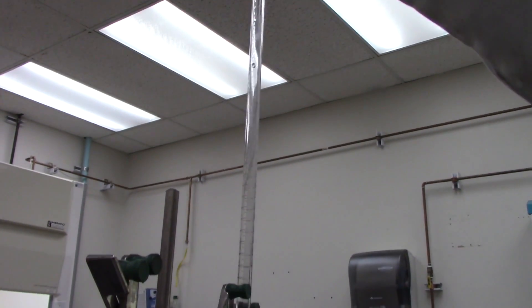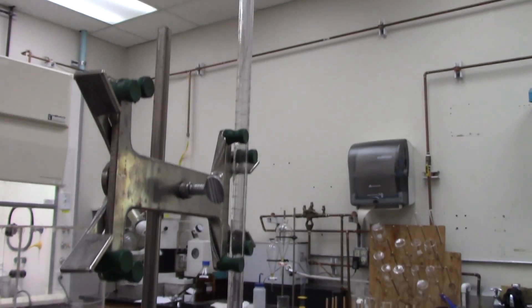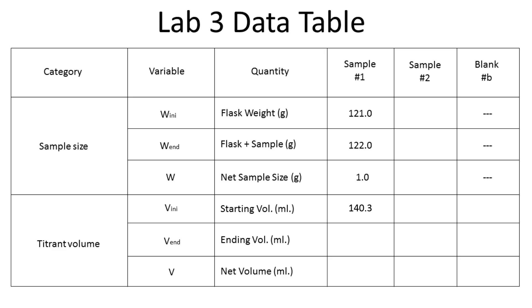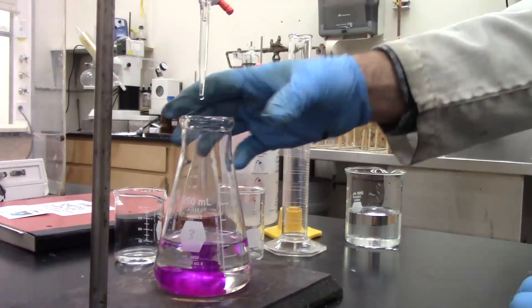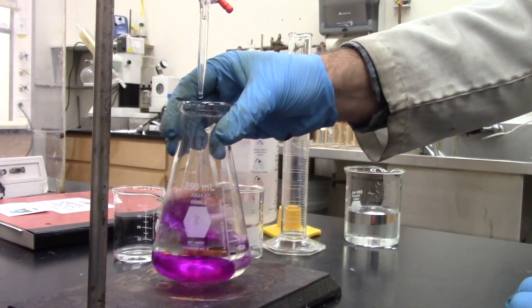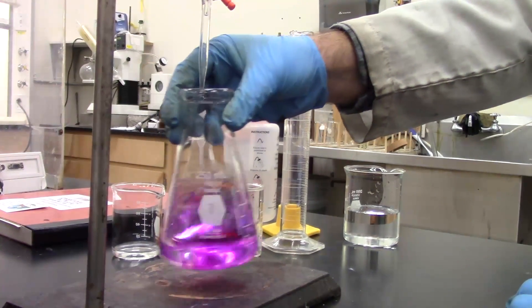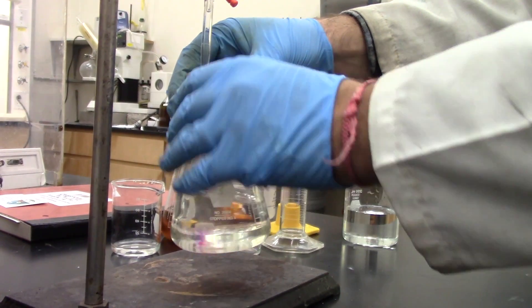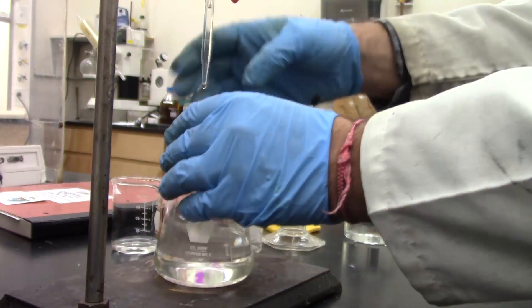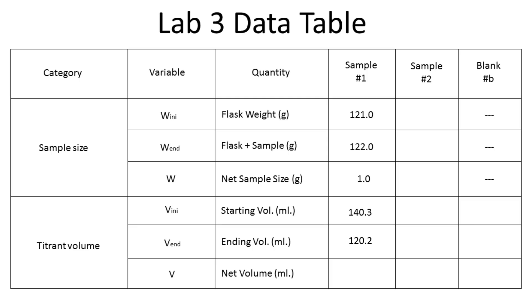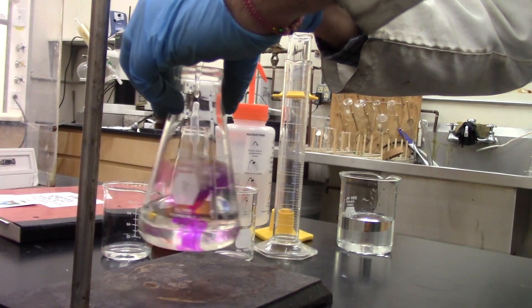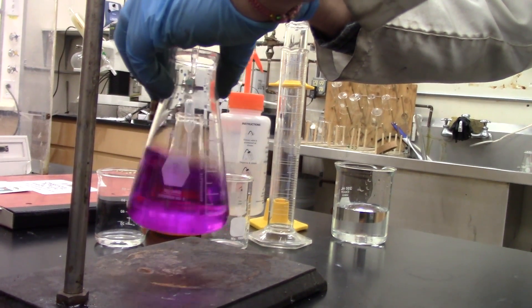Fill the burette with titration solution and record the starting volume of titrant on the data table. Carefully introduce the titrant from the burette into the flask while swirling the solution vigorously but without spattering. Stop adding titrant when the solution changes color to pink. Record the ending volume of titrant on the data table. Repeat the process for the second sample and the blank.